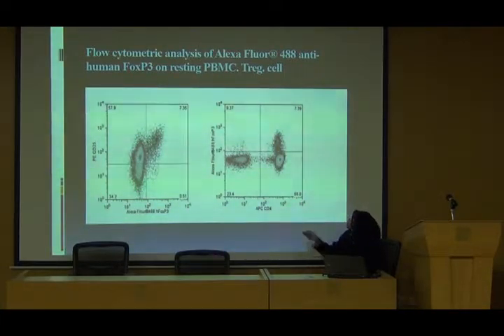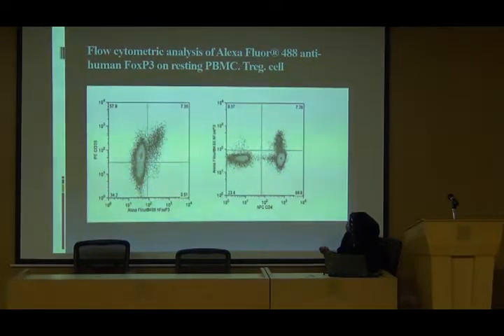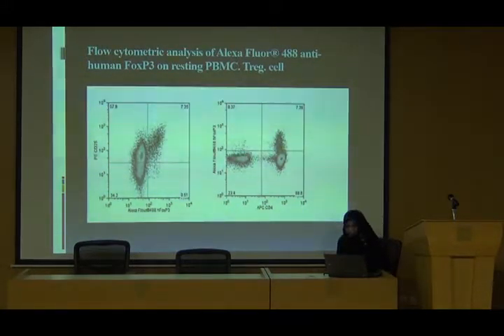And this is about also another specific cell. Some people could be interested in analyzing T regulatory cells, which is involved in immune tolerance. And its main characteristic compared to the other T cells is that it is CD25 positive, and it produces FOXP3. And it's also another protocol. Again, you collect your cells and you activate them or fix them and permeabilize, stain and acquire. And you can check that CD4 positive and CD25 positive confirm with receptor expression. And inside, if it does produce FOXP3, or the level of production of FOXP3.